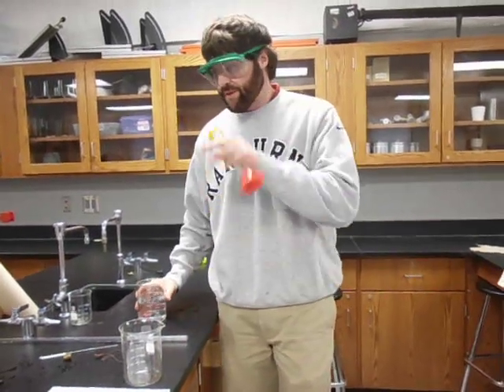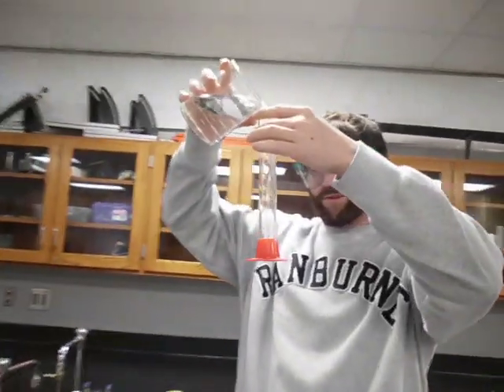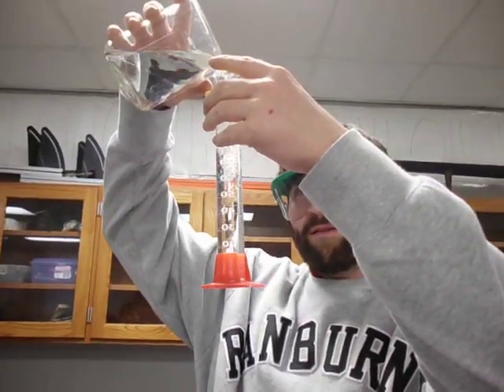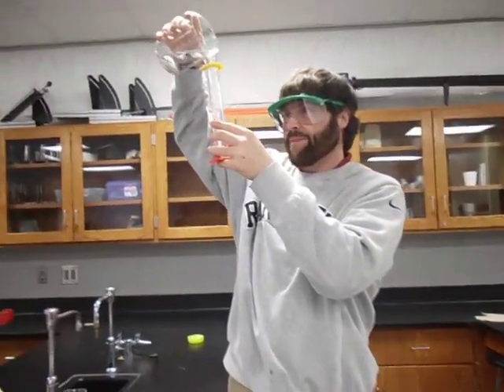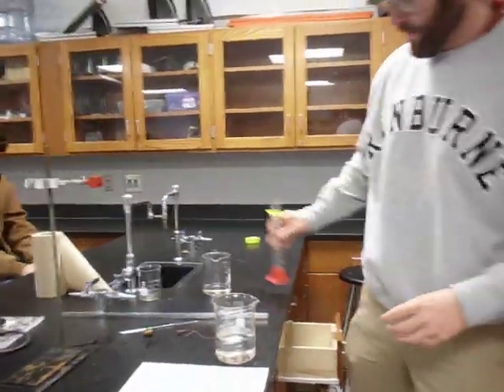To make the acid, you need 270 milliliters of distilled water. I'm using a 100 milliliter graduated cylinder to measure it out in portions. There's 100 milliliters... there's 200 milliliters... and now 270 milliliters total of distilled water.